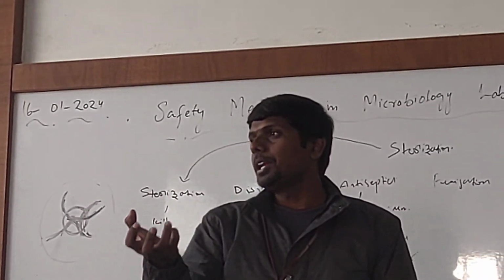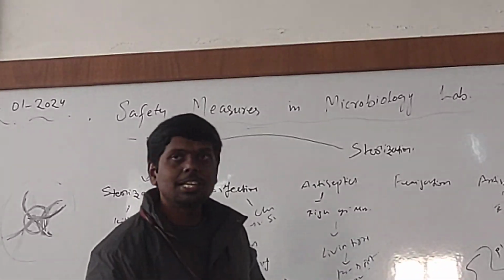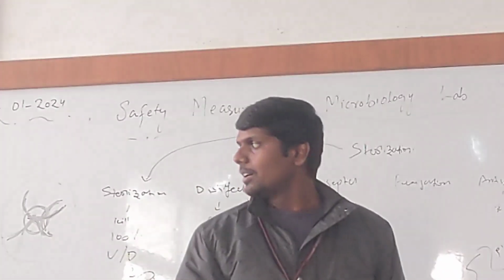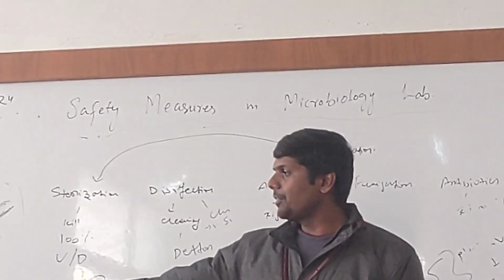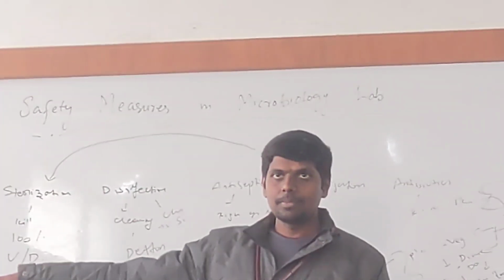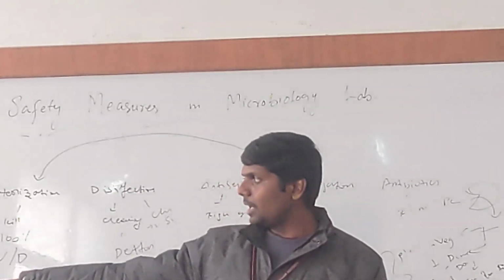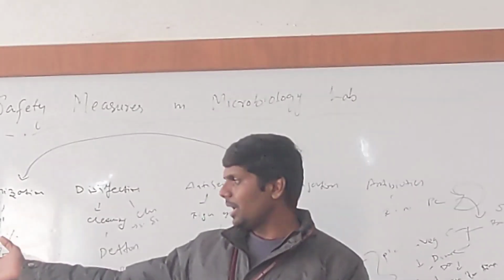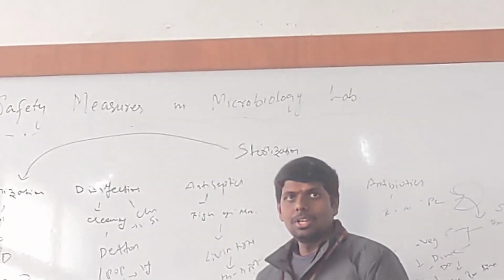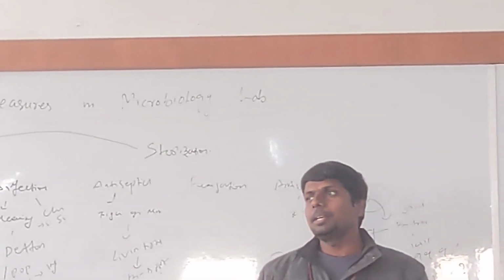How will we ensure the media is clean or not? We are going with sterilization. First we will sterilize the media and keep it in this laminar hood. In that hood only we will inoculate the sample. If you do that inoculation outside, what happens? There is a cross contamination. So that's why we are doing sterilization. So what are the methods of sterilizing?